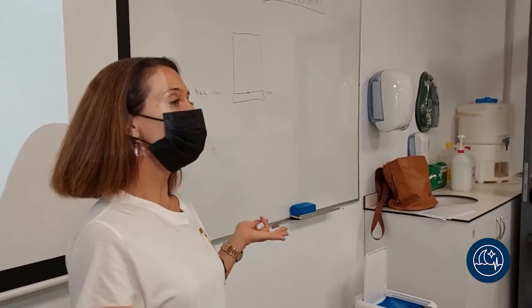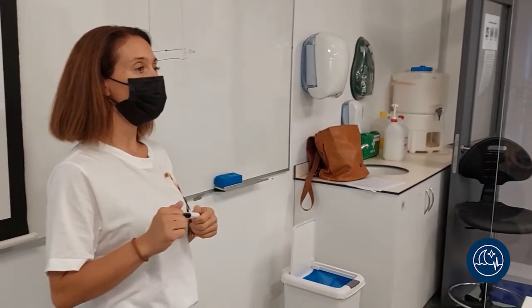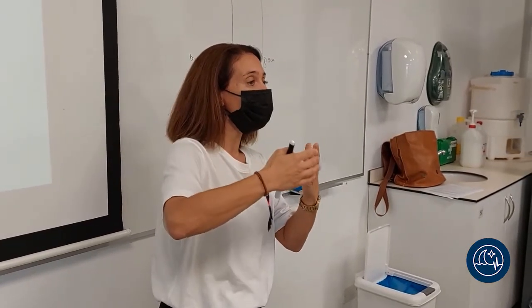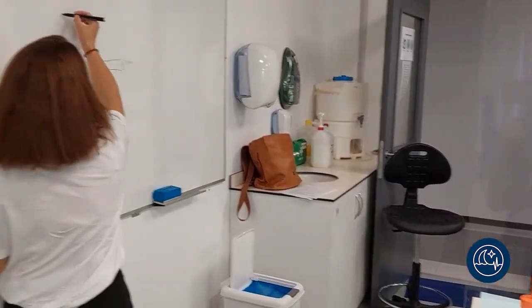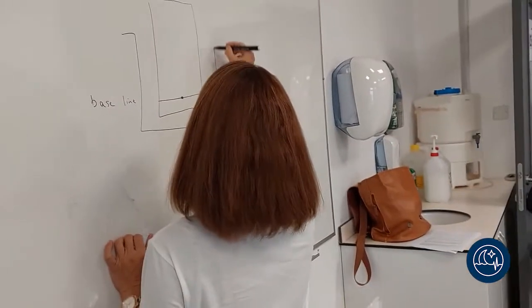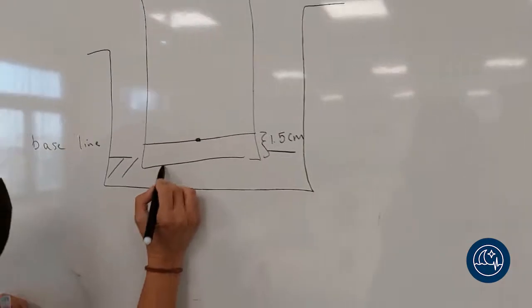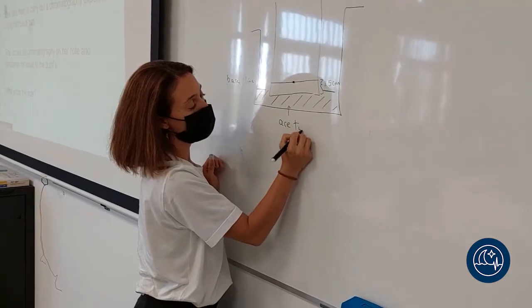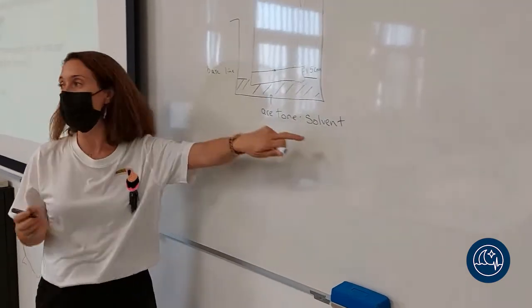We all ready? Andy, are you ready? You put your chromatography paper inside your beaker, in such a fashion that it's going to be as straight as possible. Now, before you actually put your chromatography paper into your beaker, I want you to fill your beaker with acetone. Now that, guys, the acetone is the solvent. It's the liquid that's going to do a lot of work.